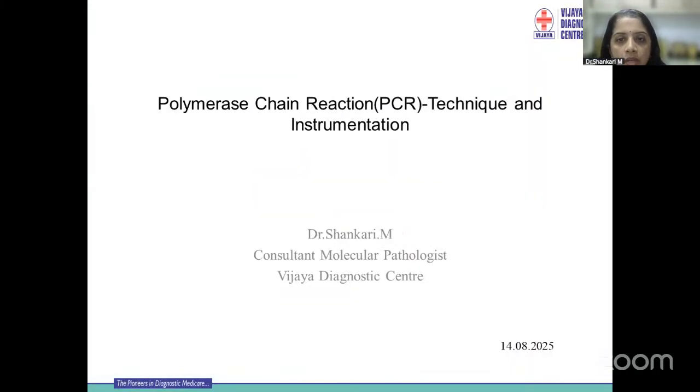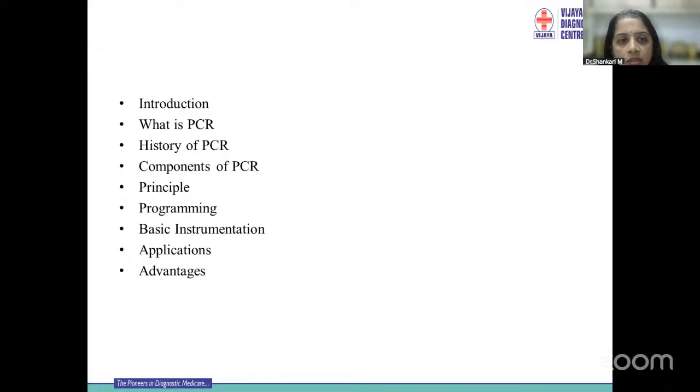So, good evening, everyone. Today is going to be a simple topic. We'll be talking about the basics of PCR. How is it done? What is the basic technique used? And what are the components of PCR? So, with this, there will be a short introduction about it. What are the components? What is the principle, programming, and the basic instrumentation and applications.